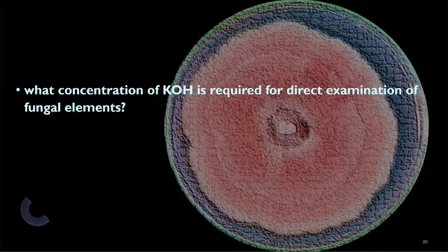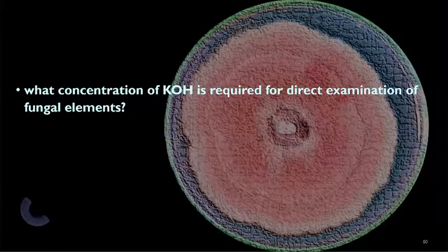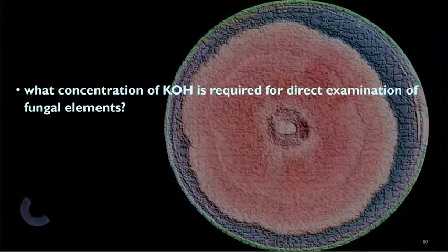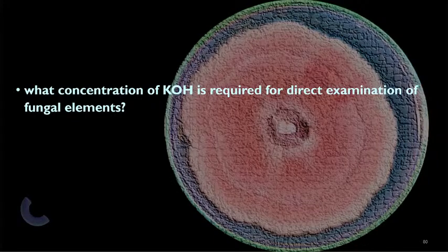Now, when you use KOH, it dissolves the skin cells. It's dissolving the skin cells, specifically the keratinized portion, so that you can see the fungal cells. Okay? These are the things that are asked of you in the board exam. Never forget this. KOH and Candida, those are really the only questions about mycology. At least tell me you know this. If there is anything you will remember, it's this part of our video today.